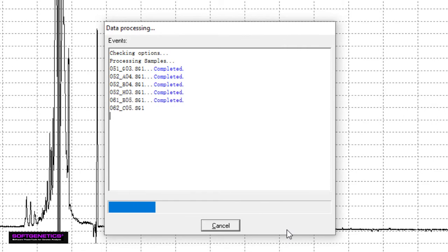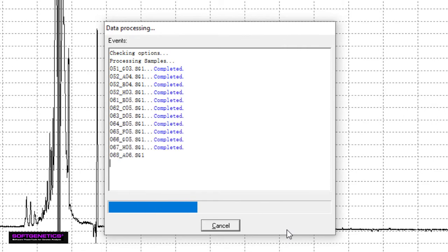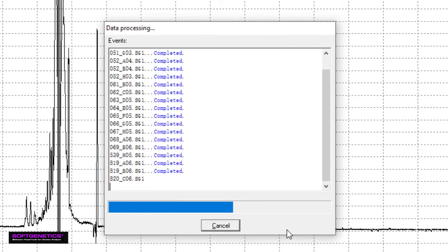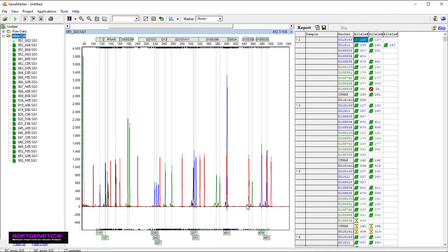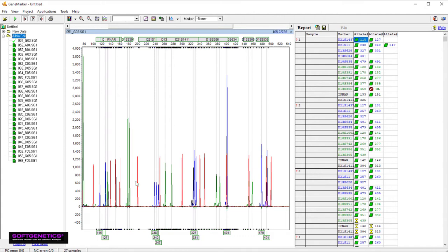Data analysis is rapid. A 96-wells CE plate takes an average of 15 seconds. Again, samples are organized in a file tree to the left, but this time they're color-coded according to their size calls. Green means that the size calling was successful. Yellow means that size calling needs verification, and red means that size calling did not occur. Allele calls are summarized to the right in the allele report table.